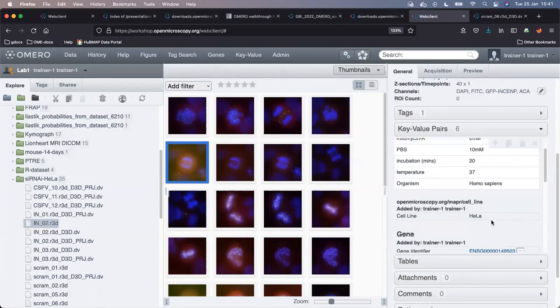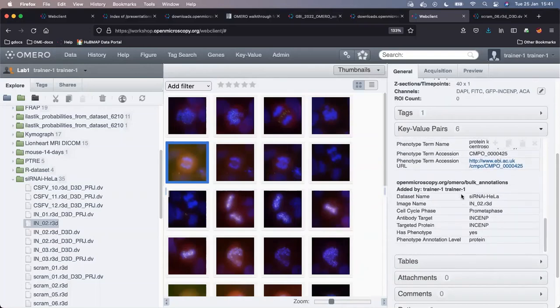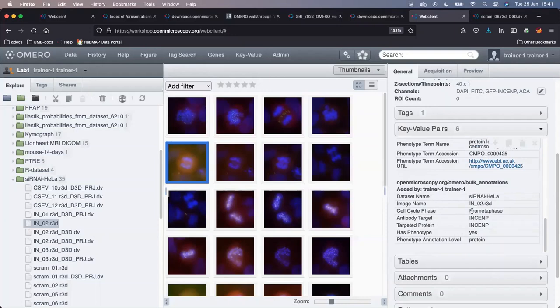And we are using them also in the IDR. And this is a foretaste of tomorrow's workshops where we can organize the key value pairs in a very nice, stable manner in groupings, etc.